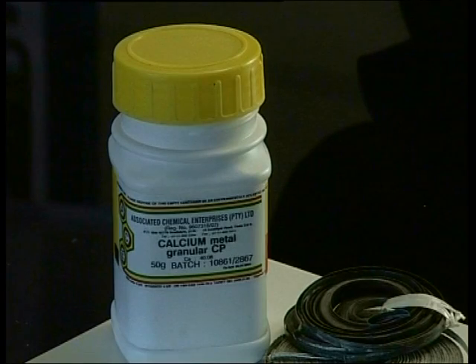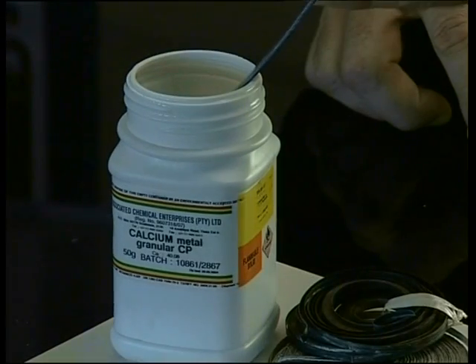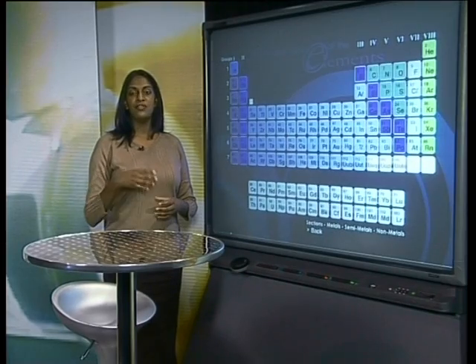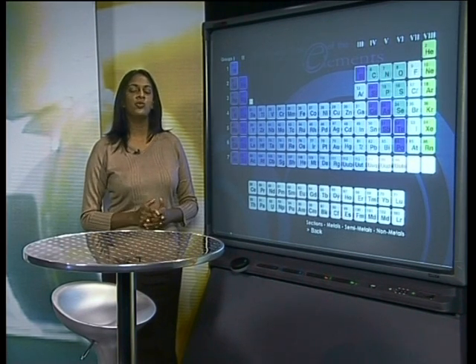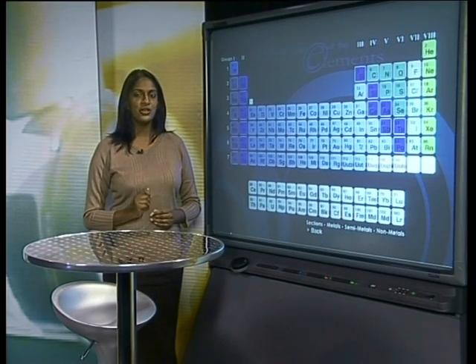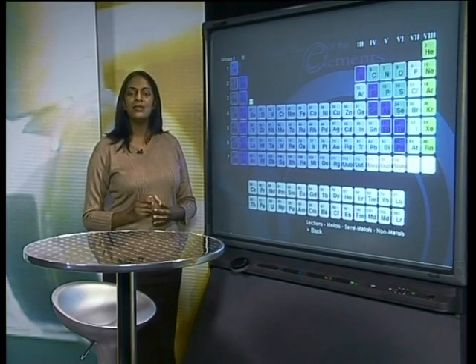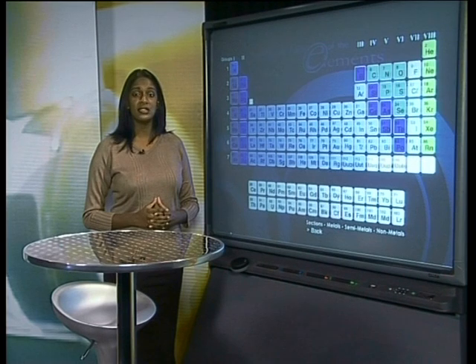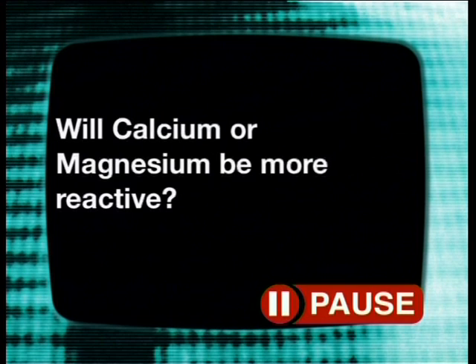Calcium is stored in an airtight container. It is a light grey shiny colour. However, it is easily coated with a black layer when left unprotected in air. It is harder than magnesium. Before we look at today's experiments, I want you to think back to the test we performed on the alkali metals. Do you recall that potassium is the element situated lowest down in group 1 and is the most reactive of the three alkali metals we tested? I wonder if the same trend applies to the alkaline earth metals. Will calcium or magnesium be more reactive?